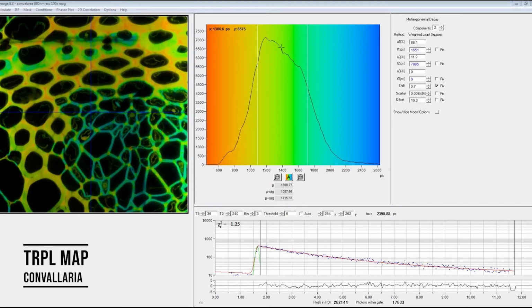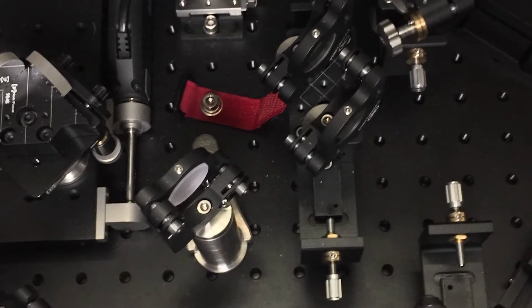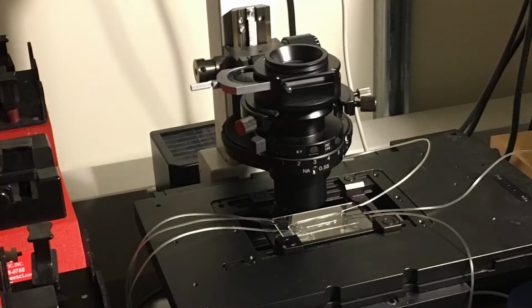The fixed beam and tunable beam can be combined in time and space to be used for coherent anti-Stokes Raman microscopy and stimulated Raman scattering microscopy. More traditional optical microscopy techniques are also available. The microscopes can be configured to accommodate a variety of samples, including experiments in microfluidic devices.